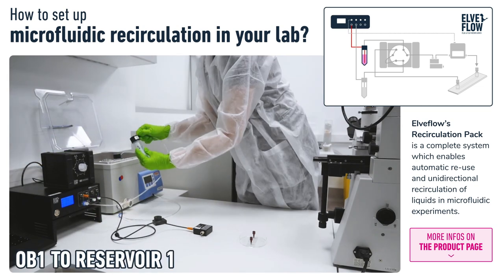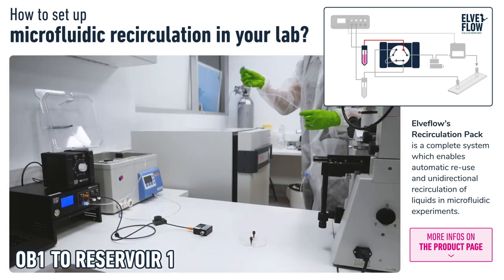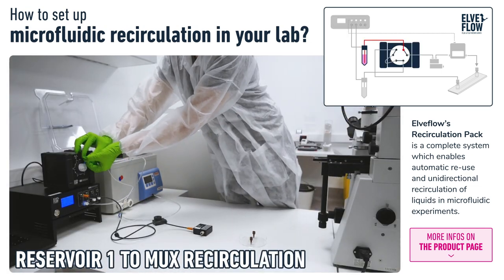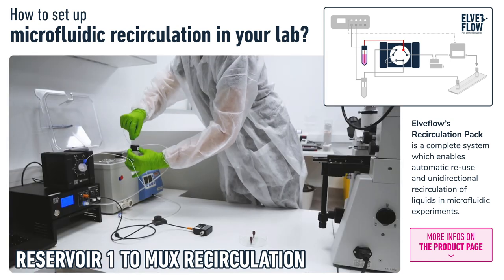The first step is to connect the pneumatic tubing for the pressurized air from the OB1 to Reservoir 1. Then we connect the PTFE tubing for liquid from Reservoir 1 to the mux recirculation.